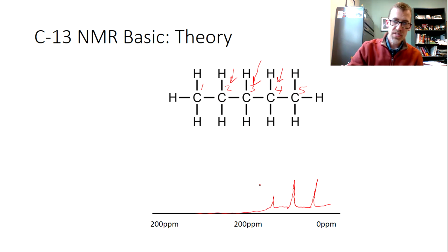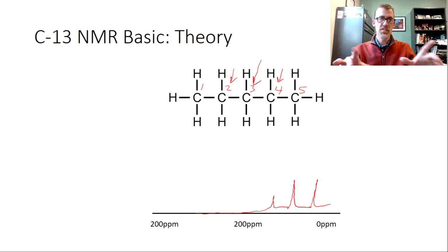All right, so this is the idea. Clearly this is meant to be just an introduction, so that in lab you can pretty well jump right into some practice and fine-tuning your understanding here. But if I were to summarize, use this molecule, pentane, as an example. We have a solution of pentane. It goes into the magnet, it goes into the instrument, and you'll get a chance to do this.